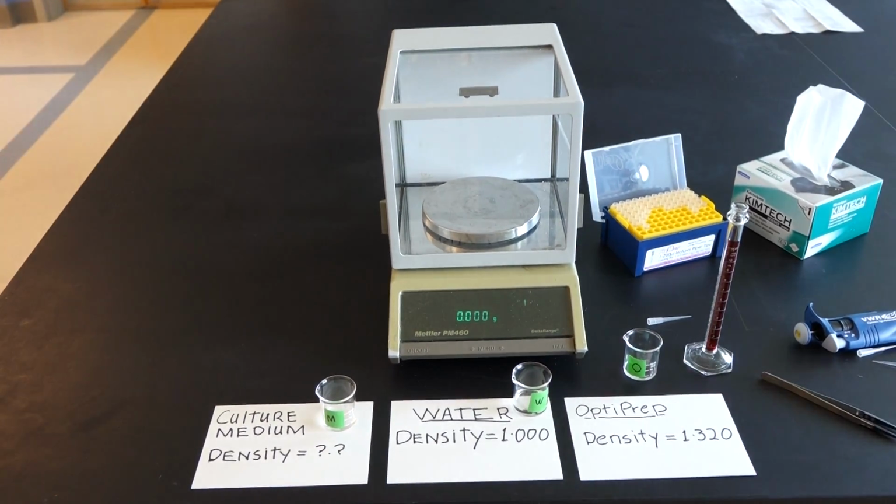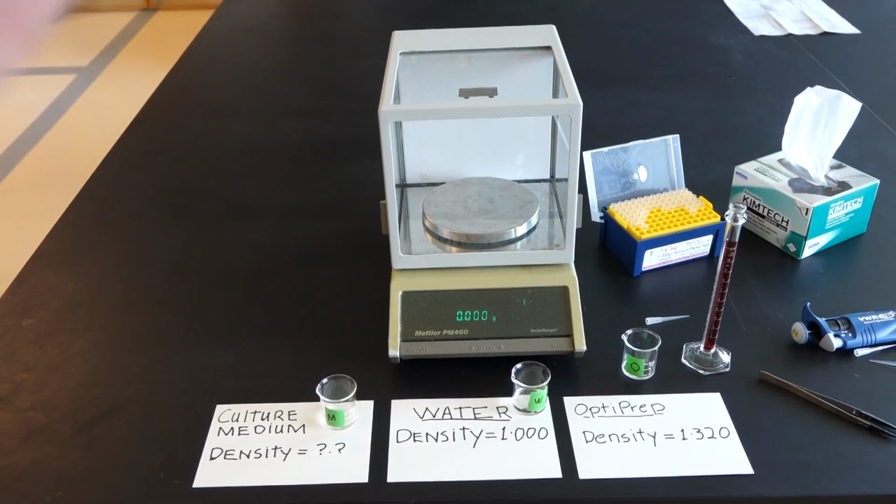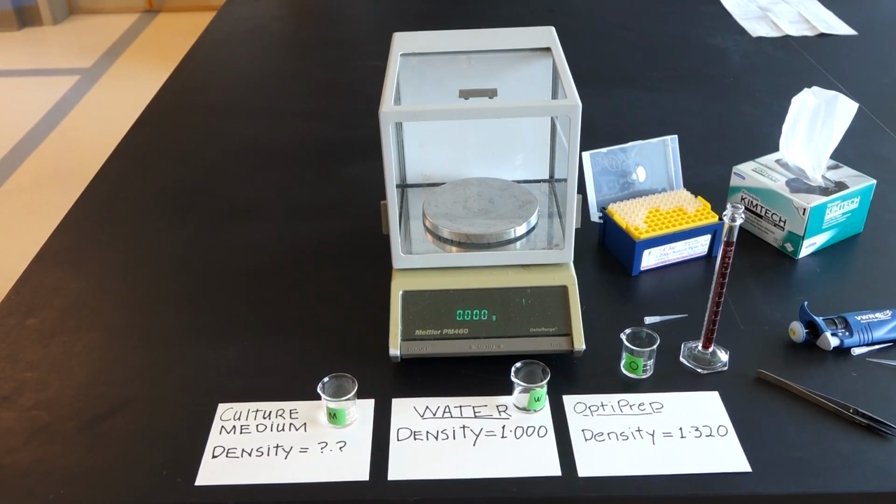So I want to show you a quick and easy way to measure the density of liquid medium, aqueous media or other liquid medium. Obviously, density involves measuring mass per unit volume. You can do that many ways.